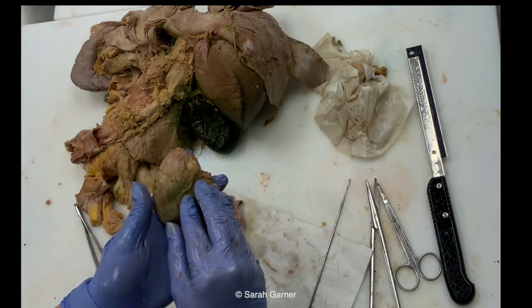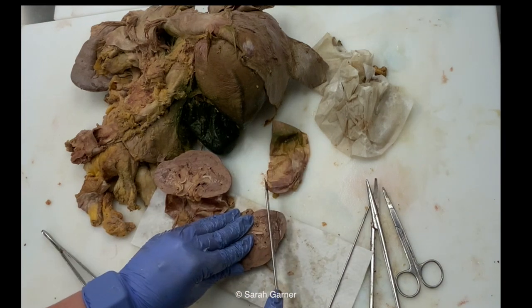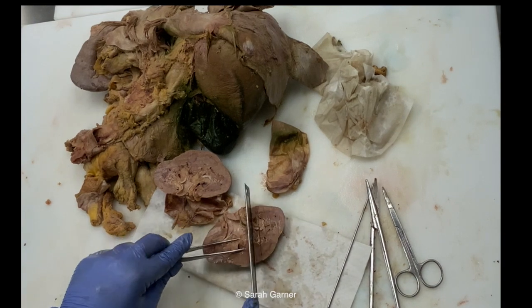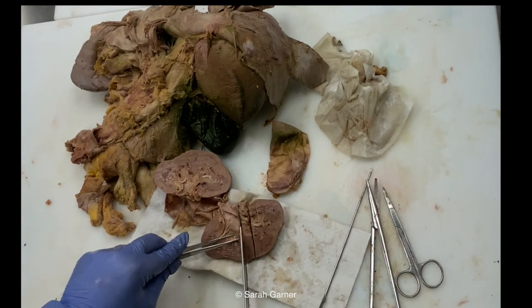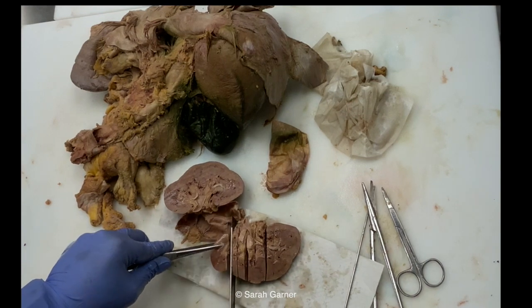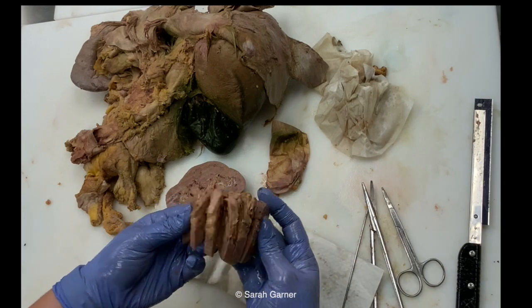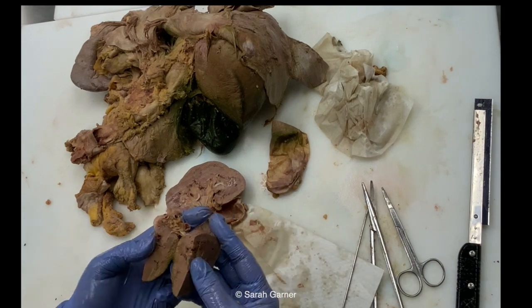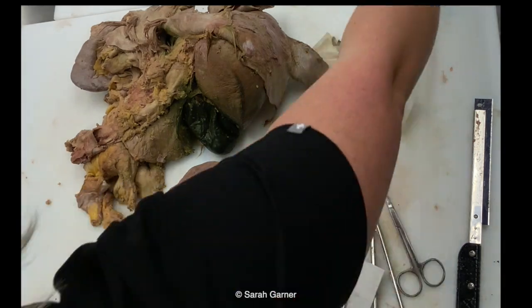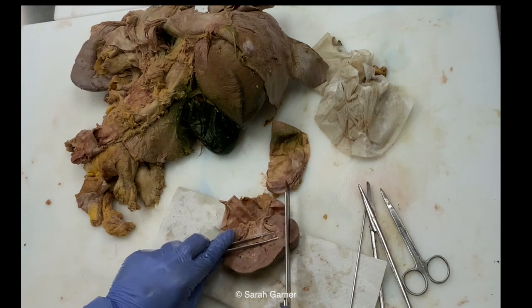So this one also looks a little bit granular, which makes sense because these are from the same person, right? So then same thing, we're going to essentially just cut superior to inferior to get as much cut surface as you can. So you would thoroughly and fully inspect this. Okay, and then put it with your matching adrenal. Same thing with the other half.